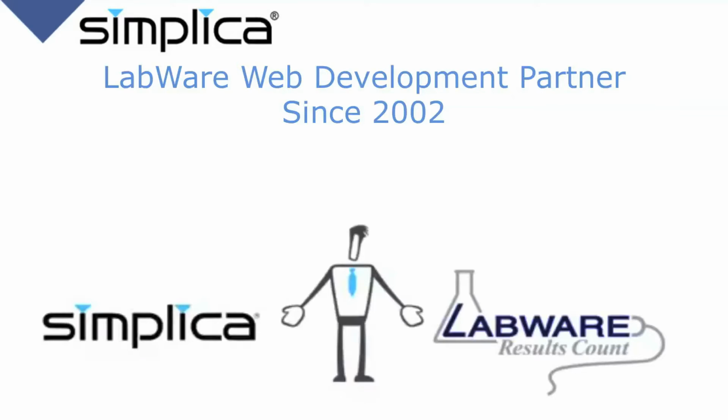How did we become so specialized in interfacing to Labware products? Well, the reason is we've been Labware's web development partner since 2002. In this role, we have been part of the core Labware development team with responsibility for the web technology stack used across all Labware products.